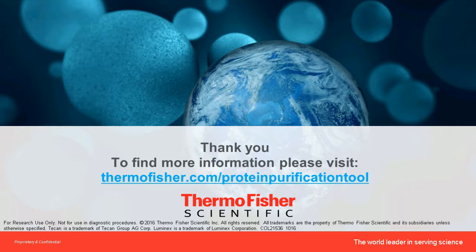Because the samples are enriched, as Bhavin showed, you should be able to use any mass spectrometer from a sensitivity perspective. We, of course, prefer high-resolution mass spectrometers because they will give you more specificity. Particularly if you're interested in post-translational modifications, a high-resolution detector will give you a more compelling result.